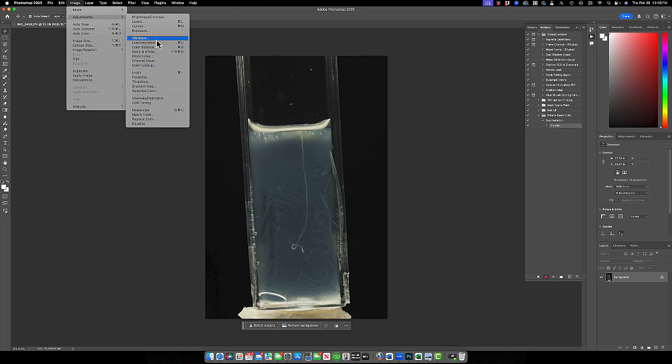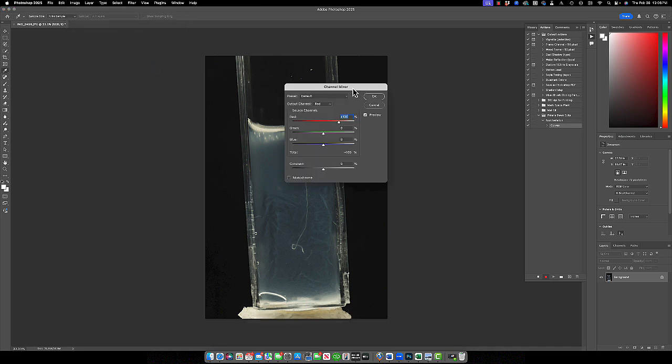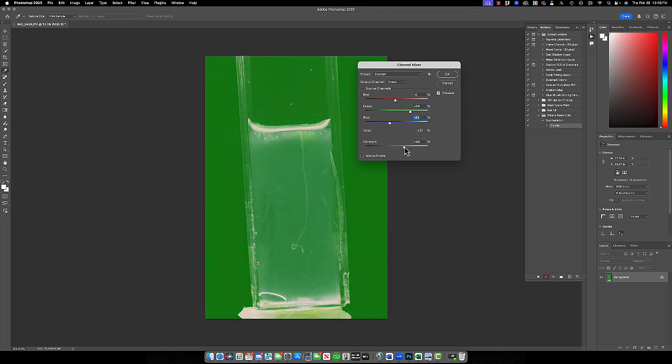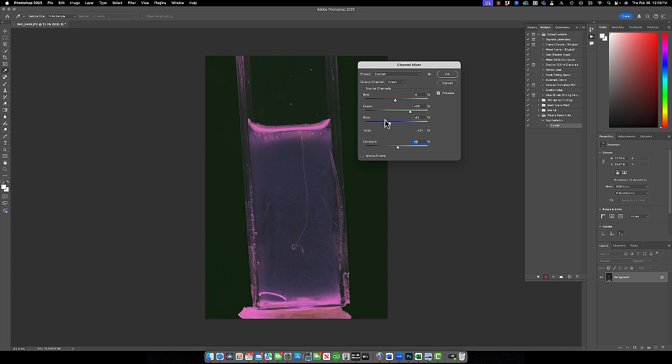What I'd also like to do is look at the channels. I'd like to see if the white that we're seeing has any colors that perhaps the cuvette does not possess. So just by taking a look at the different color bands, we might be able to get something that's a bit more hyperspectral. You can see here everything is turning pink, but perhaps there's some spectral data located within the root where this process might actually turn it green while the cuvette might remain pink.